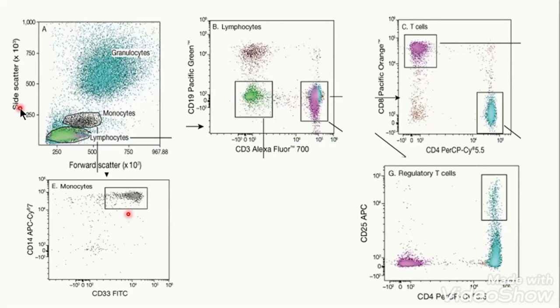If I take the bone marrow, so many of you are doing pharmacology experiments on rats and mice, and you just take the bone out of it. You can isolate the bone marrow. And in bone marrow, you have so many types of cells: long-term hematopoietic stem cells, short-term hematopoietic stem cells, common lymphoid progenitor, common myeloid progenitor. In bone marrow, you can get 17 to 18 types of cells. And if you want to analyze all of them simultaneously, then you find out their specific proteins and start adding the antibodies.